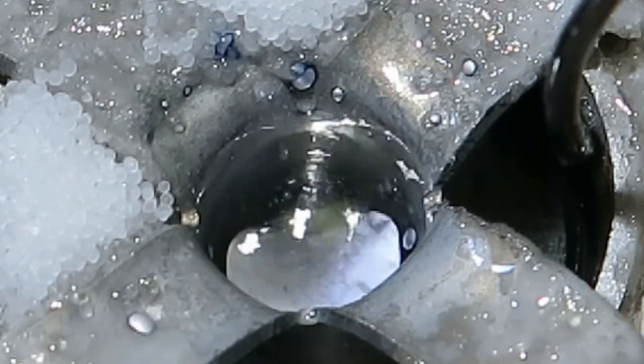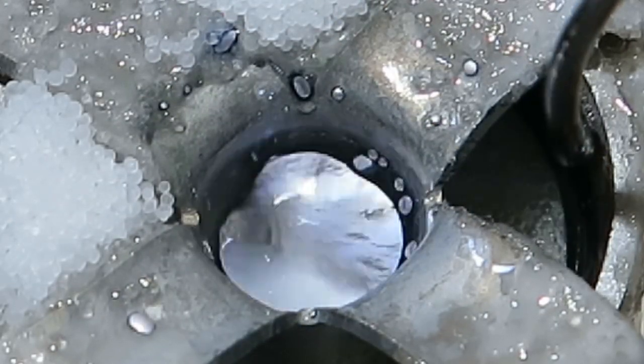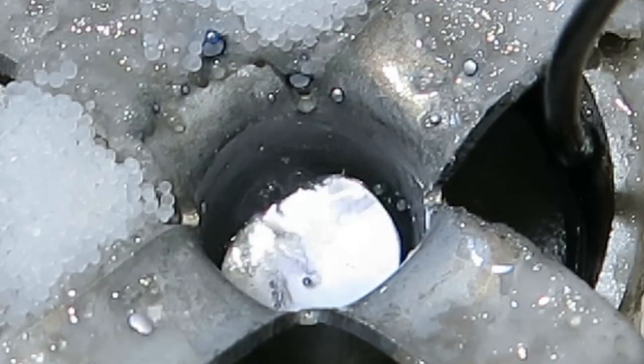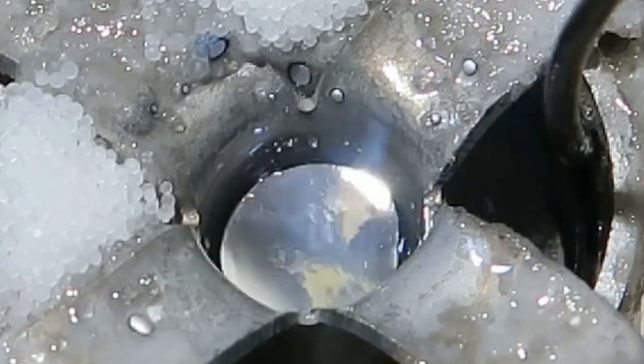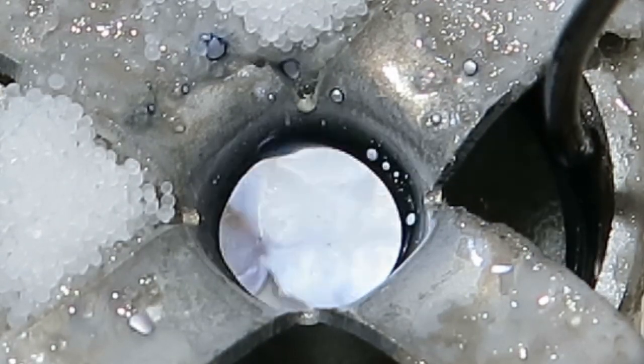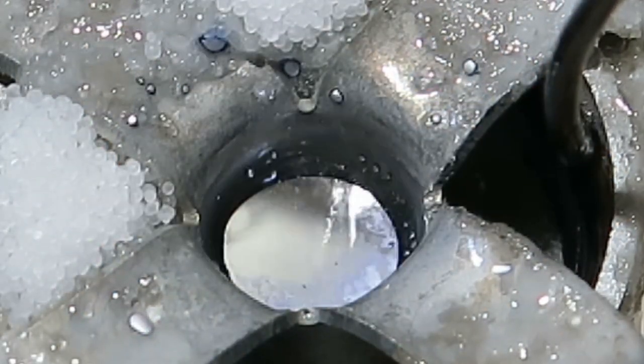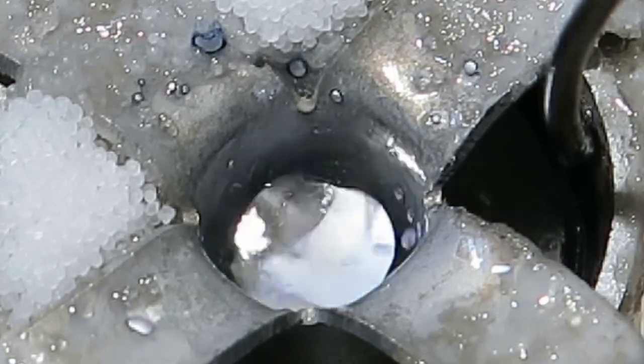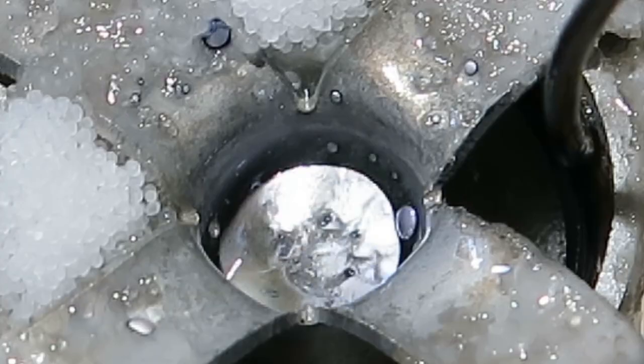Now I don't understand at all - oh, I see what's happening: the cell is leaking. Anyway, I think I will let it leak, because at some point it must seal itself up.